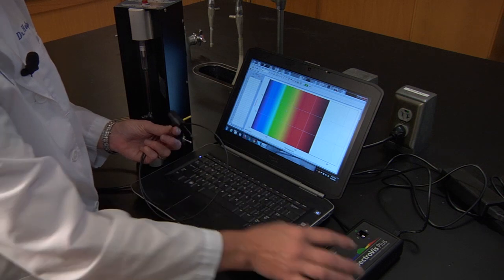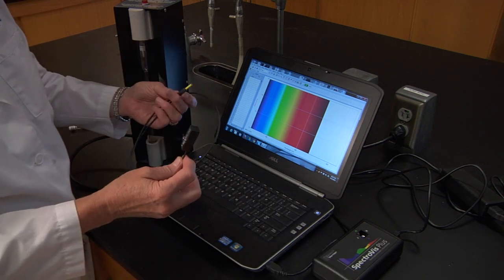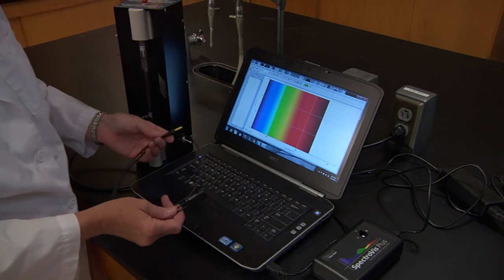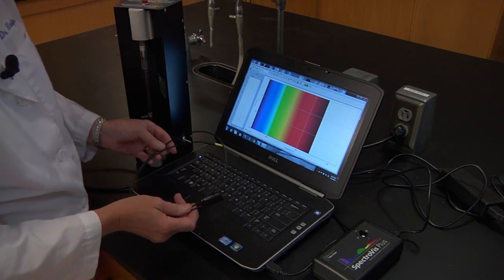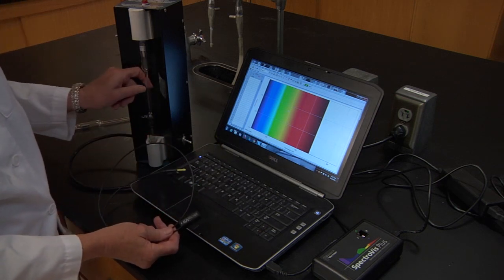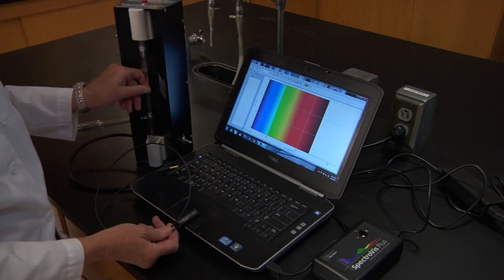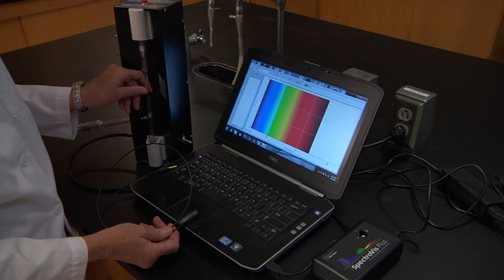We're going to use a spectrophotometer and a fiber optic cable to measure the wavelength and the intensity generated by excited hydrogen atoms.